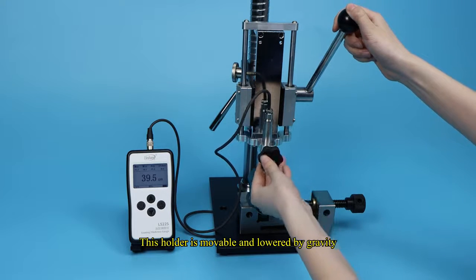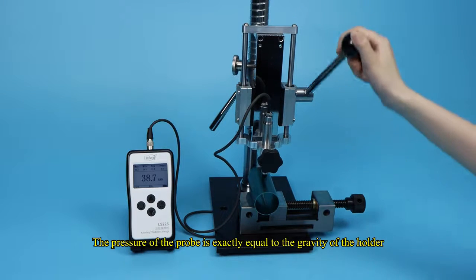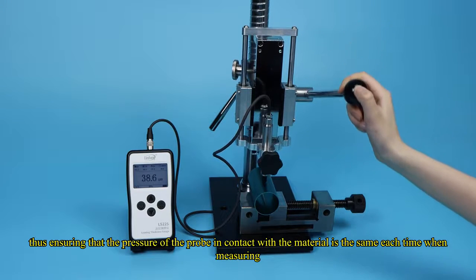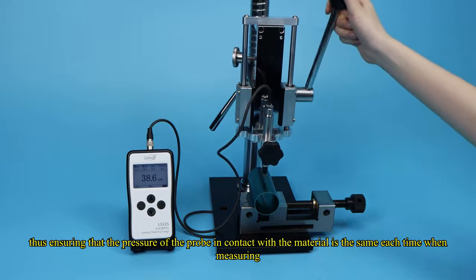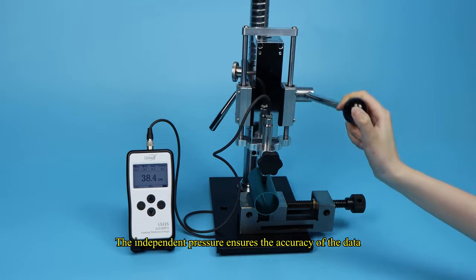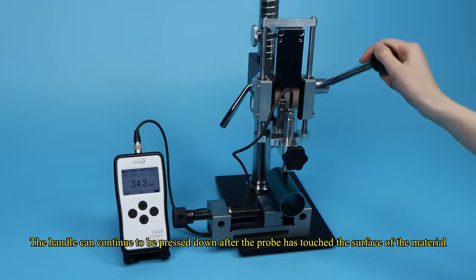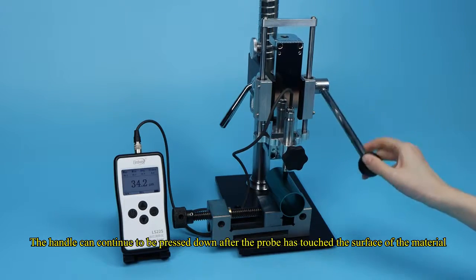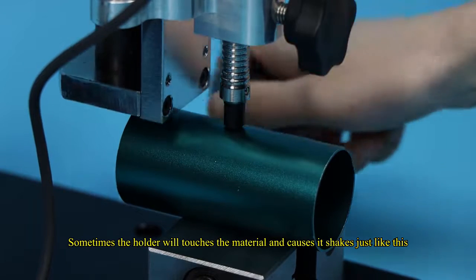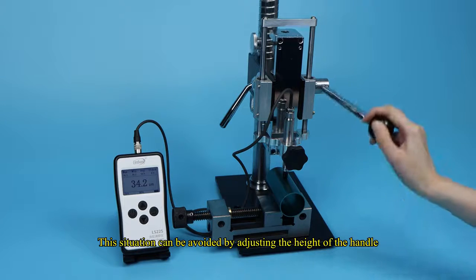This holder is movable and lowered by gravity. The pressure of the probe is exactly equal to the gravity of the holder, thus ensuring that the contact pressure on the material is the same each time when measuring. The independent pressure ensures the accuracy of the data. The handle can continue to be pressed down after the probe has touched the surface. Sometimes the holder touches the material and causes it to shake — this situation can be avoided by adjusting the height of the handle.